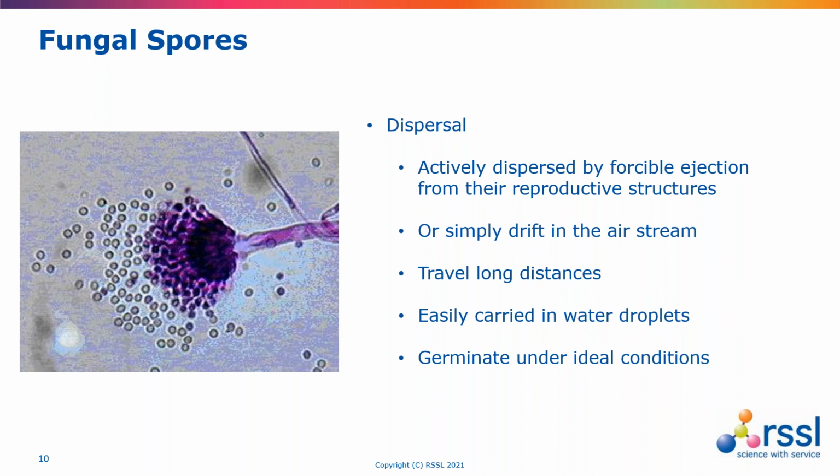The other thing about fungal spores is there's a lot more of them, and they're also more likely to germinate than bacterial spores. The picture on the slide is of a species of Aspergillus, and it's undergoing spore dispersal. So it's a picture that's been captured of that process.